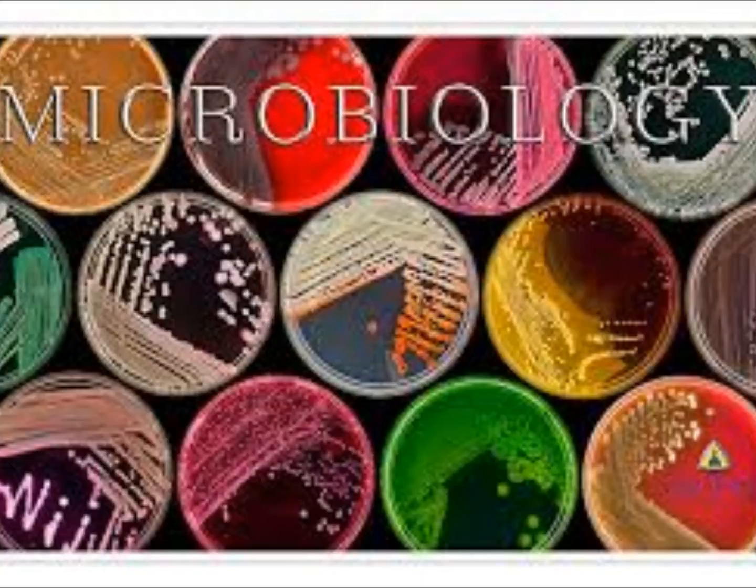Okay, so you're gonna wanna look at these plates and compare the sizes. When it's pinpoint, it's almost like a little speck on the plate. Sometimes on the first day, you have a really hard time seeing the pinpoints. You may miss them because they're so tiny. Candida glabrata is one of those organisms. Sometimes you'll look at that plate, especially at the 18-hour point, and you don't see anything on it. Then you look at it at 48 hours, and all of a sudden there's this pinpoint organism on there.